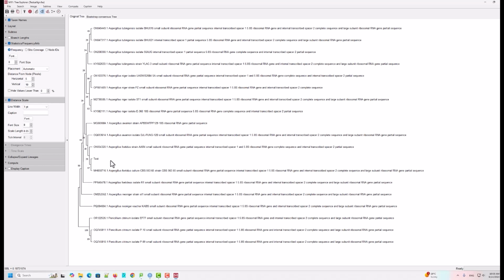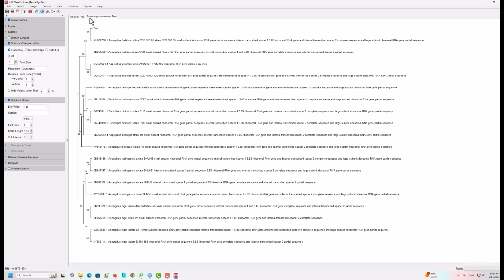In the previous lecture we also discussed that it is to know the exact position and exact identification of our species, which genus and which species it is related to, and what the divergence is, the evolutionary perspective of that species, how we can say that this species evolved before or after some specific species.